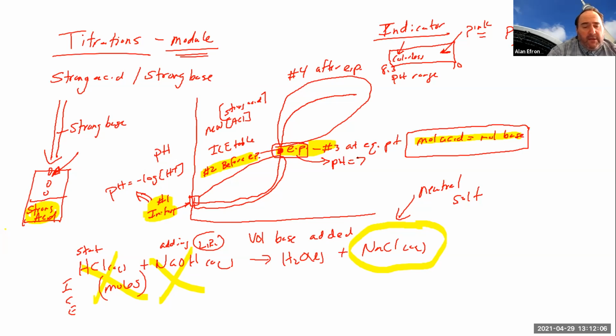Clearly, if we sail past the equivalence point, in that fourth part of the titration, in this particular case, we obviously are now just dumping a bunch of strong base in there, right? Because we've already at this point used up all of our acid. So we continuously dump a strong base in there. And that's why we do see that pH really start to rise here, right?